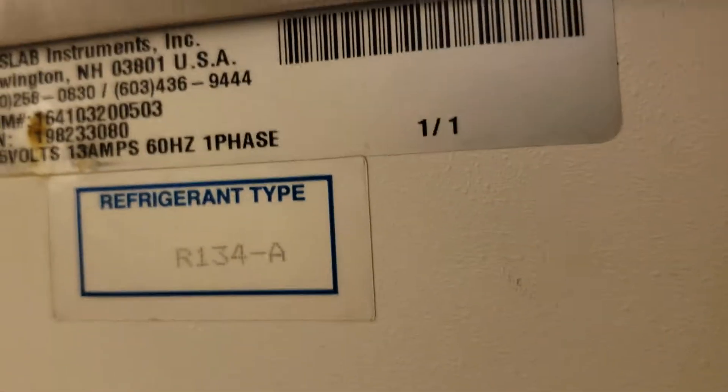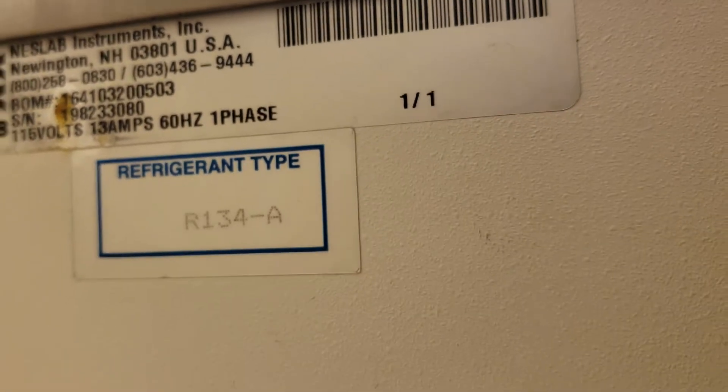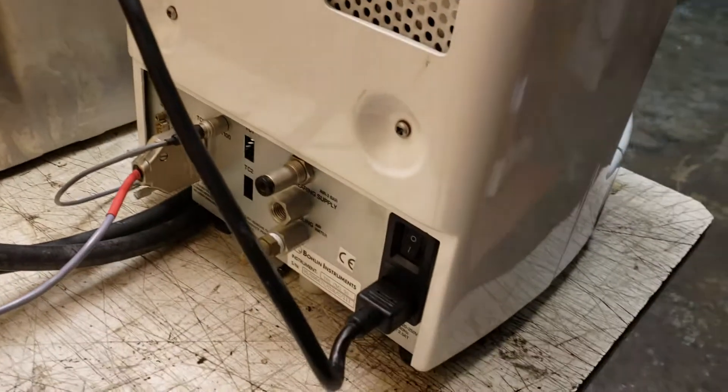There's the serial number. See, that says NESLAB — so that threw me off. I actually called NESLAB to try and figure out how to turn the thing on. Didn't need to do that.